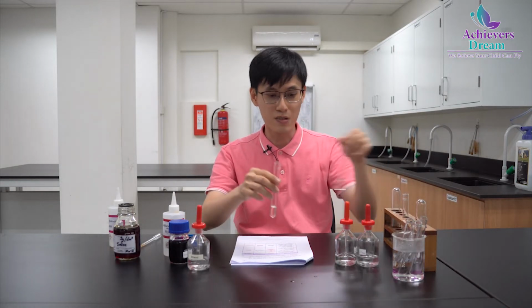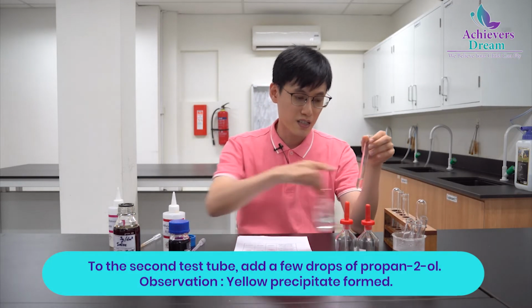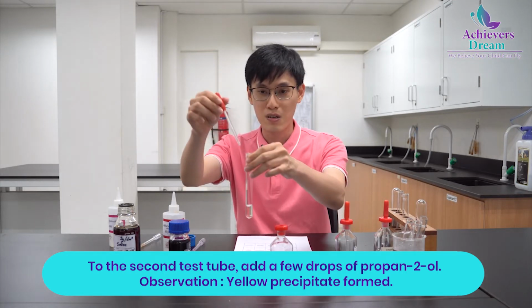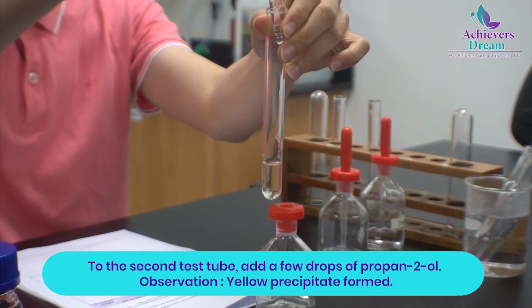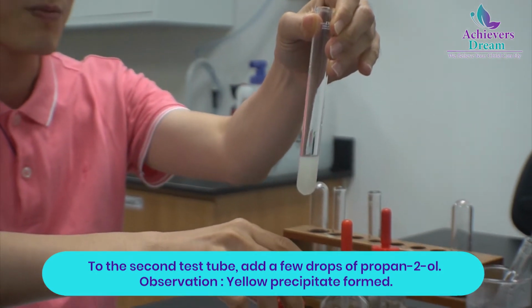I have 2 other solutions of alkaline aqueous iodine prepared already. We'll be adding the next 2 alcohols one by one. So this is propan-2-ol, which has the iodoform group too. Look at the precipitate appearing again. That's your iodoform, the yellow precipitate.